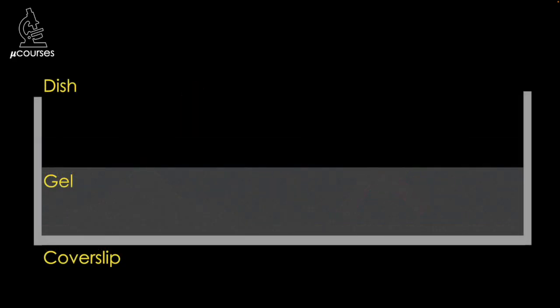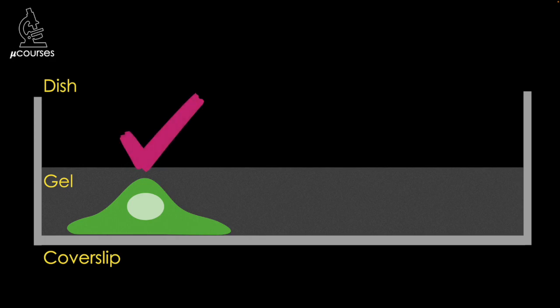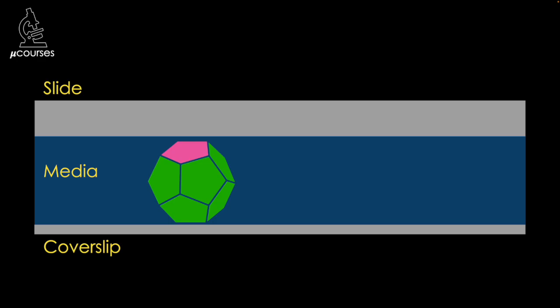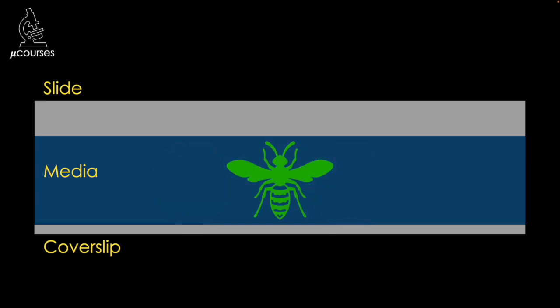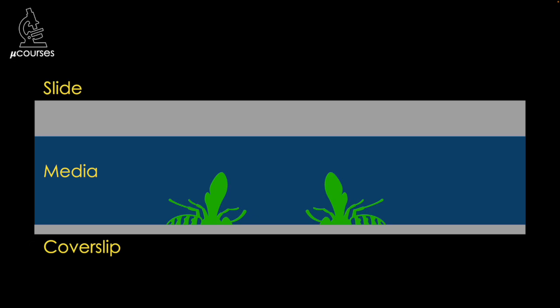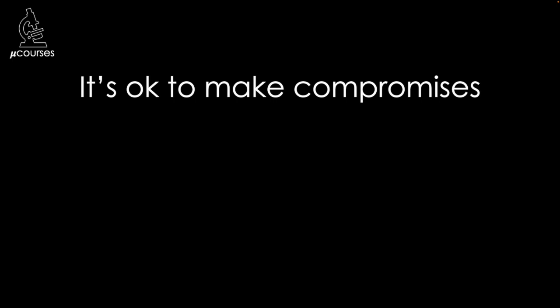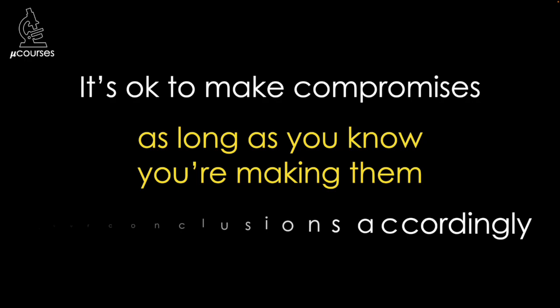When imaging live cells in coverslip-bottom dishes, grow the cells as close as possible to the glass surface. If your specimen requires a gel matrix, image quality will be far better if the cells are attached to the coverslip with the gel on top, versus growing the cells on top of the gel. When working with larger specimens, try to mount them so the area of interest is closest to the coverslip, or cut or section the specimen to get the area of interest close. If your sample absolutely cannot be placed on the coverslip, you'll most likely need to accept lower image quality as a compromise.